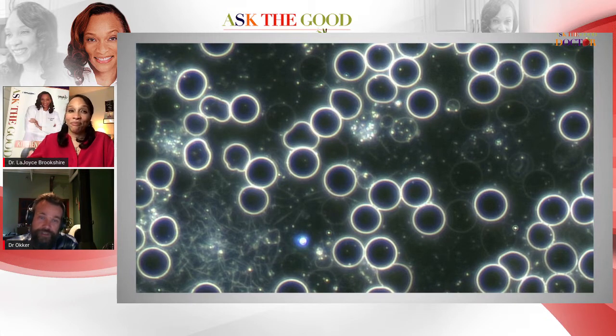That's the easiest, and when we see it in the blood, it's fairly common to see parasite indicators in the blood, and in those cases that's where we start, because the toxicity indicators, the pH, the liver stress, all of those can be aggravated or even caused by a parasitic infestation.